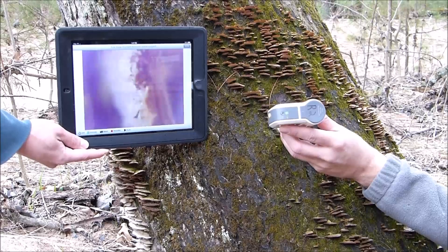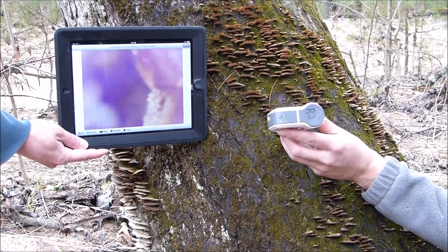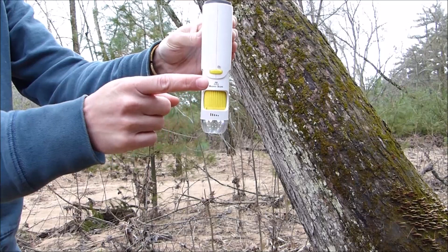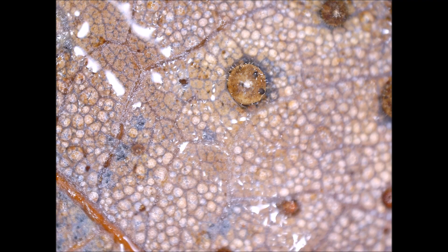The digital microscope provides a live feed view of what is being inspected. There is also a camera feature on both the microscope and the WiViewer app. The student can snap pictures or record videos of what is being viewed and store them on the iPad to save these digital artifacts for later use.